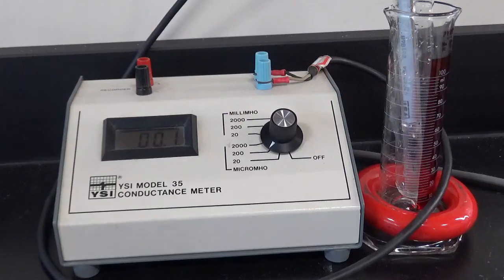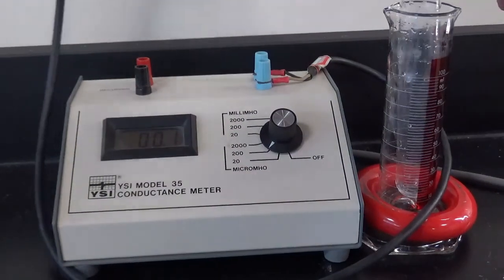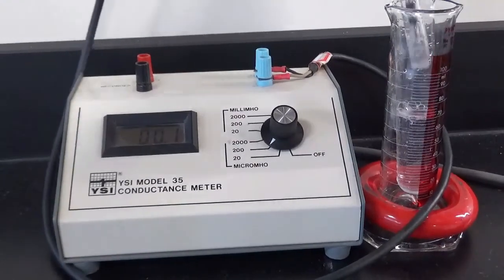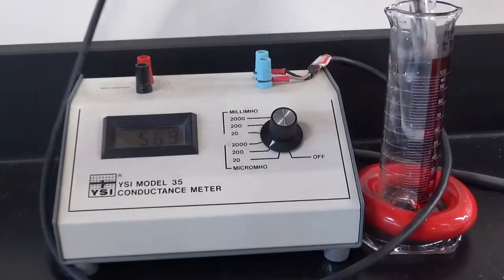All right, so solution 4 is next. Pour a little in, rinse it, pour it out.